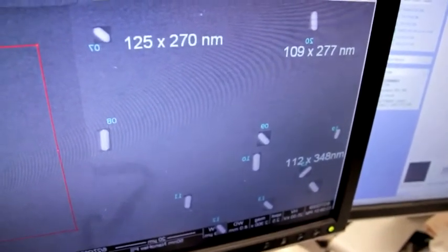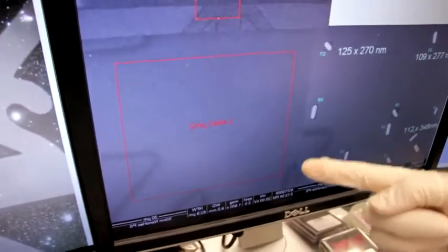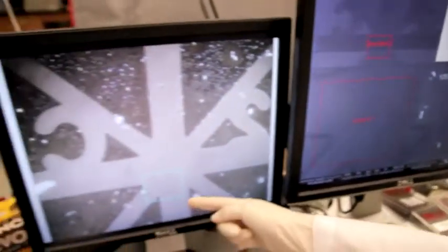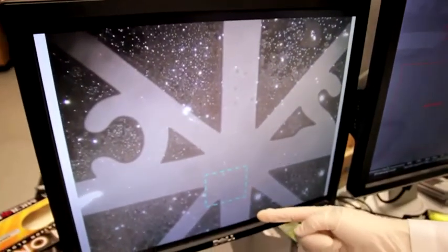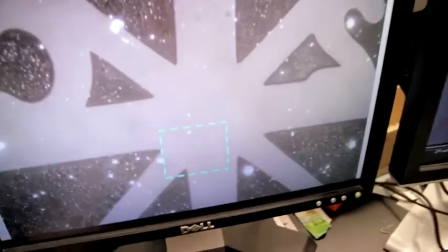Using an indexed TEM grid, we've been able to create a map on the sample, which allows us to identify this region in scanning electron microscopy and then identify the same region in dark field scattering microscopy, which allows us to visualize the scattering of nanoparticles as bright spots against a dark background.